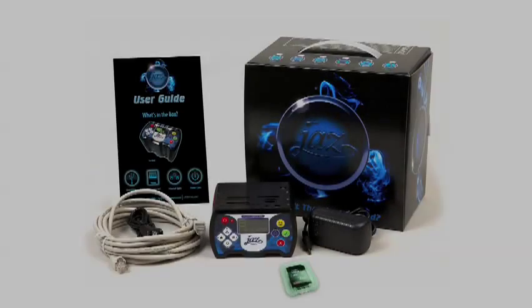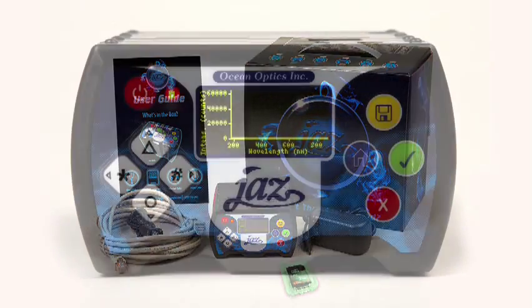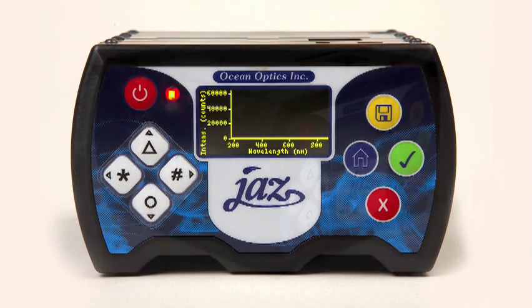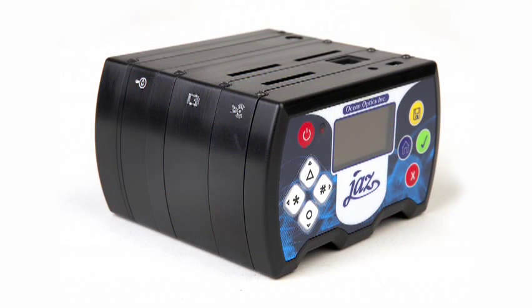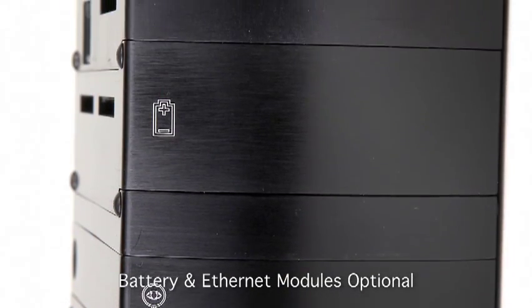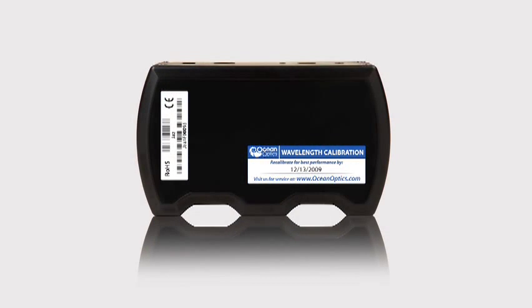Your complete JAZZ system includes several standard items. Let's take a look. This is your new JAZZ spectrometer. The modular structure houses a powerful microprocessor, an onboard OLED display, an optional rechargeable battery, and Ethernet connection. If you turn the JAZZ unit over, you'll find the serial number and a recommended date for your next wavelength calibration.